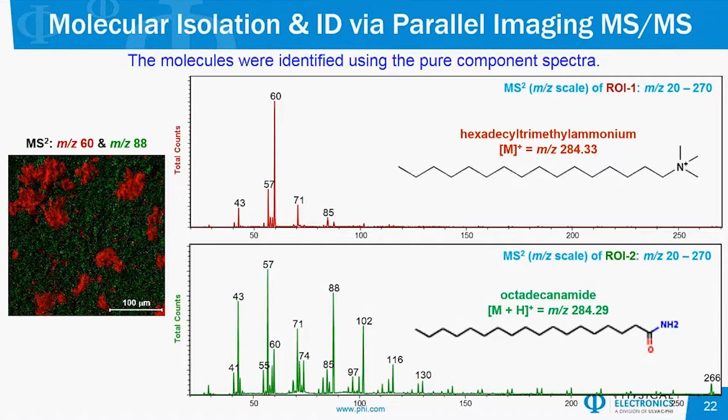Octadecanamide has an exact mass of 284.29, and hexadecyltrimethylammonium has an exact mass of 284.33. It would take a mass resolution of about 9,000 to fully resolve those peaks. In this particular case, the sample was a little bit rough — you can see a shoulder at mass-to-charge ratio of 284, but the peaks are not resolved. So the tandem MS identification and imaging comes in really handy for the identification.